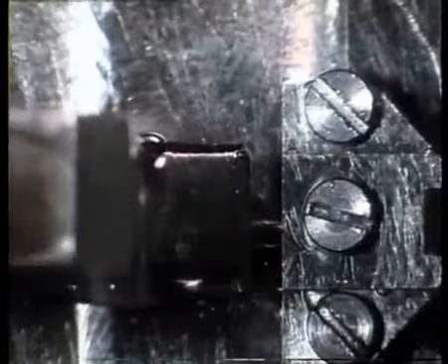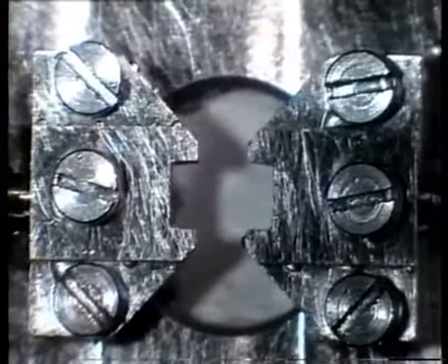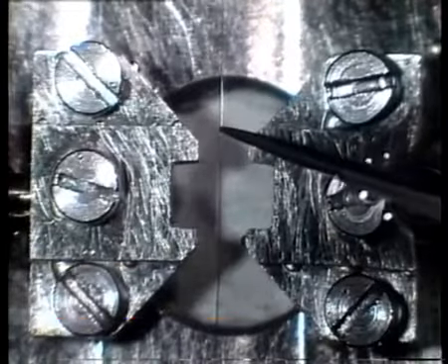Here you see the mounting heads. The one to the left is connected to a micrometer screw. The one on the right is connected to the force transducer. The wires are approximately 2 centimeters long. They should have blunt ends and be as straight as possible.